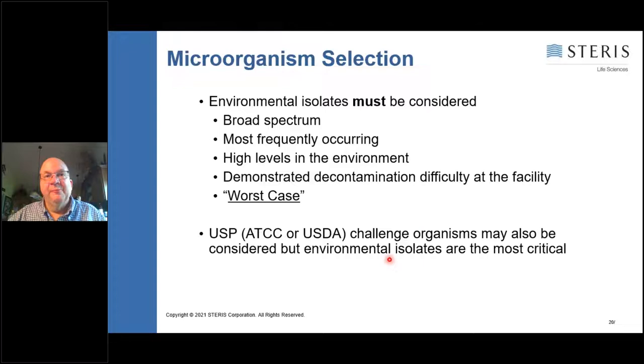And then when we talk about additional reference strain testing, many times the manufacturer, like our company, will have reference strains available, so reference strain data with different coupon studies. You can also include some in your study with American type culture strains or USDA strains.